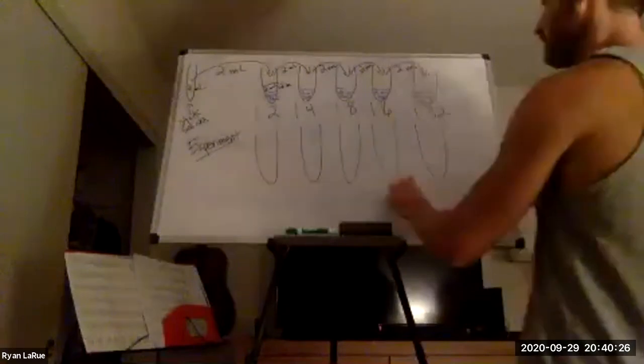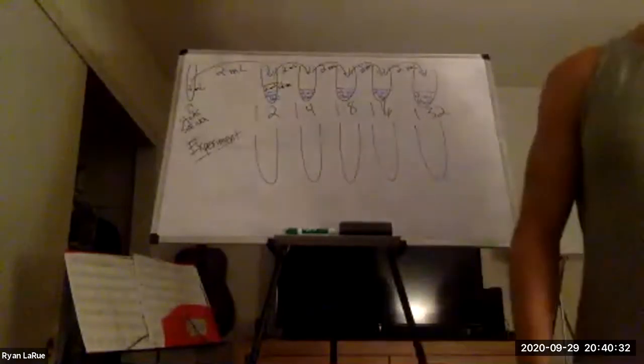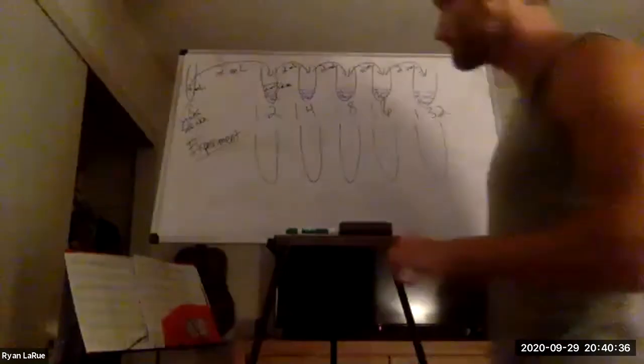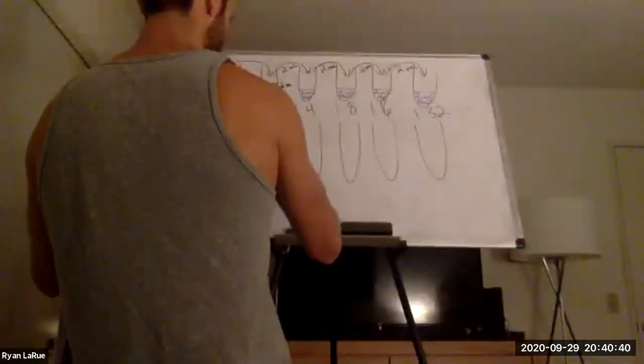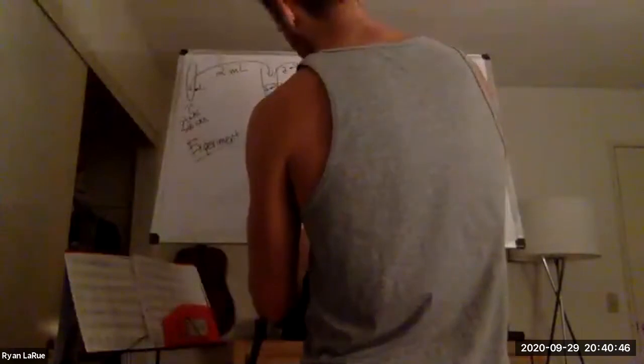How many is it? Five? One, two, three, four, five. Okay. And in each of these test tubes for our experiment, I'm going to add two milliliters of starch. Two mils of the starch, which is a liquid in our lab. I'm going to add two mils to each one.